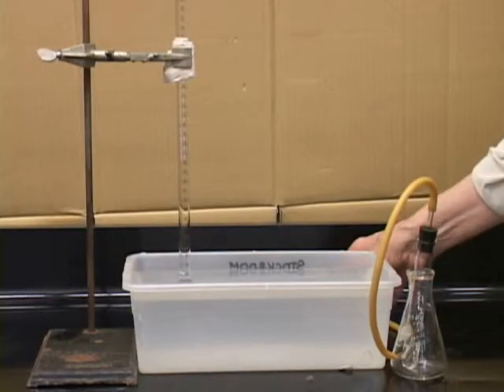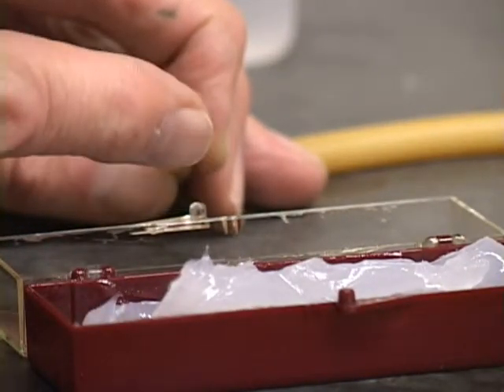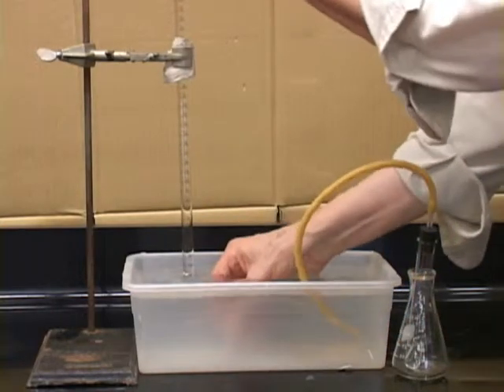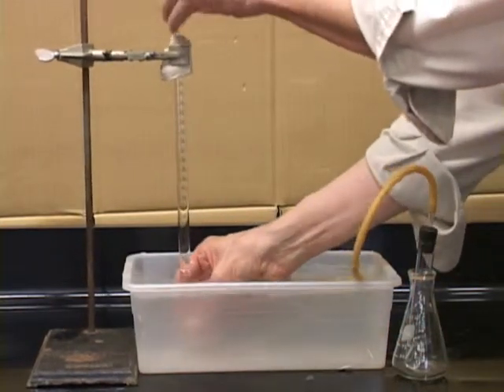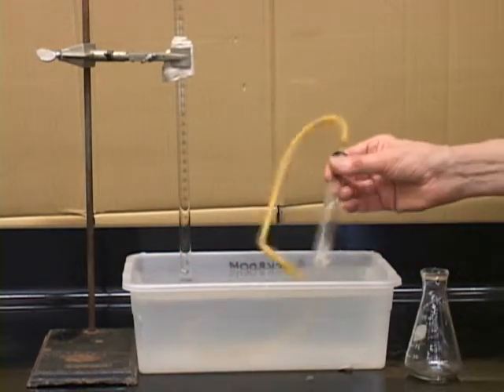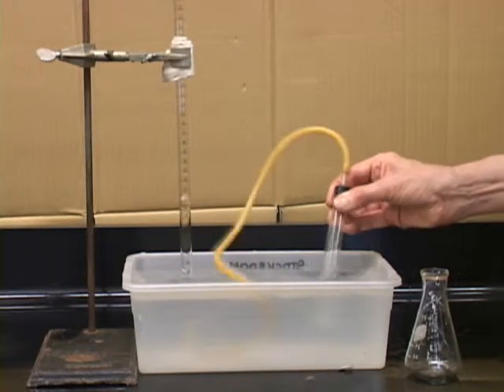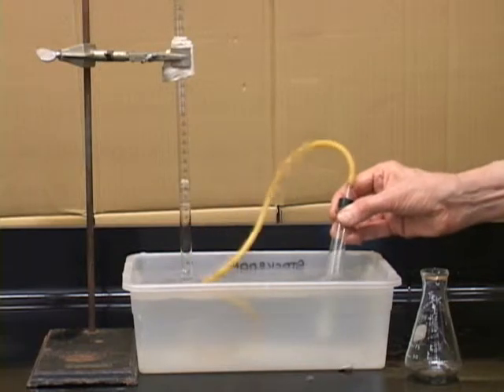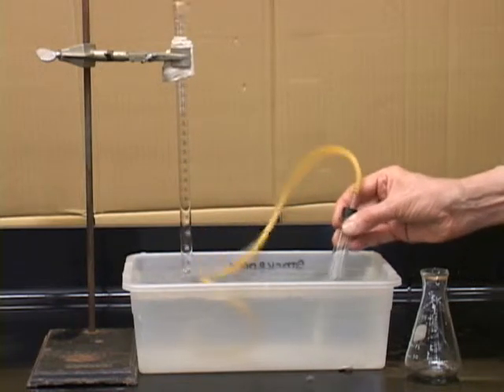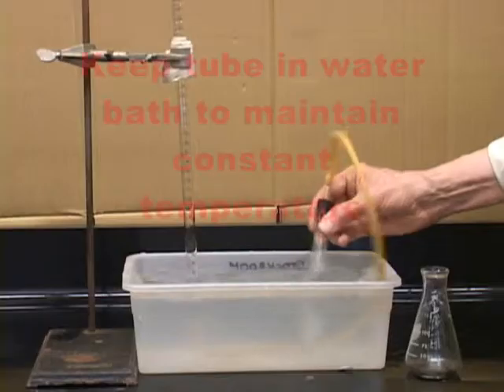To start the reaction, cover the tip of the gas inlet tube with a thin film of grease. Then insert it in the bottom of the gas burette. Then mix and sink the boat in the reaction tube. Now keep this tube in the water bath to maintain a constant temperature. And there she goes. Here's a close-up of what's happening. As soon as the boat sinks, the metal begins to react with the HCl, generating hydrogen.